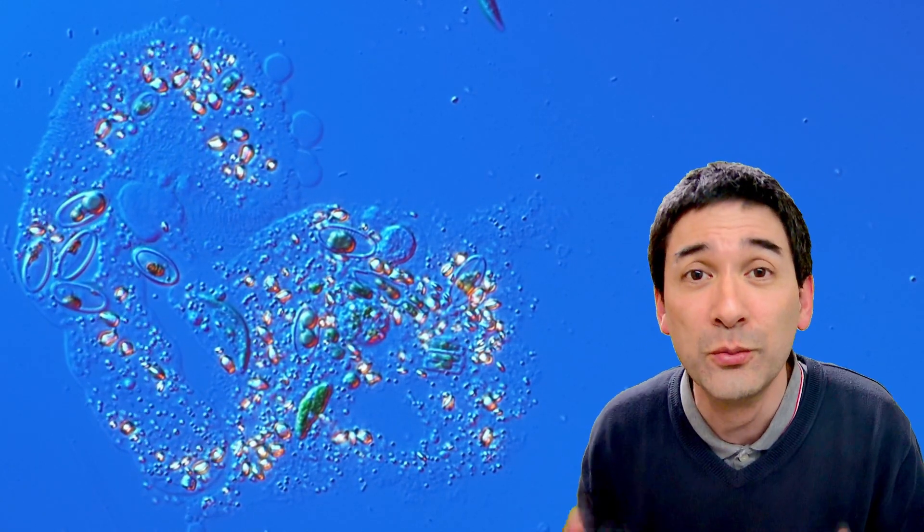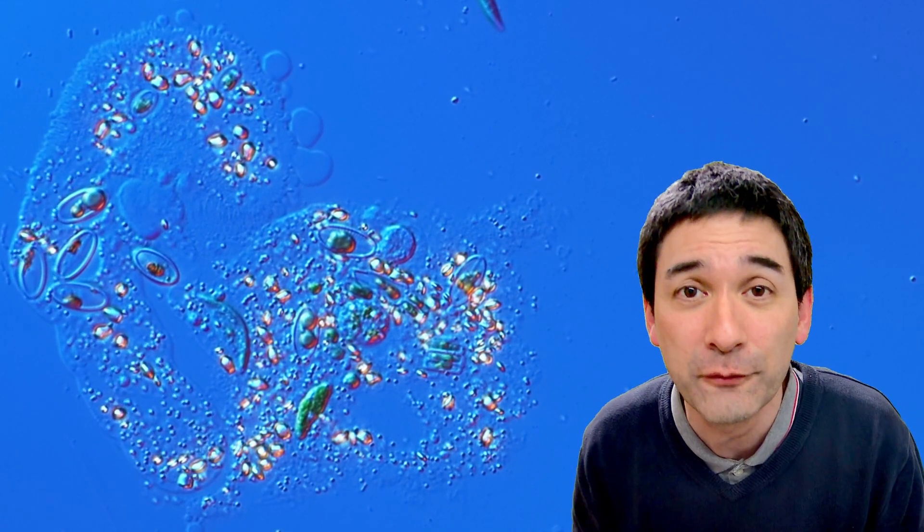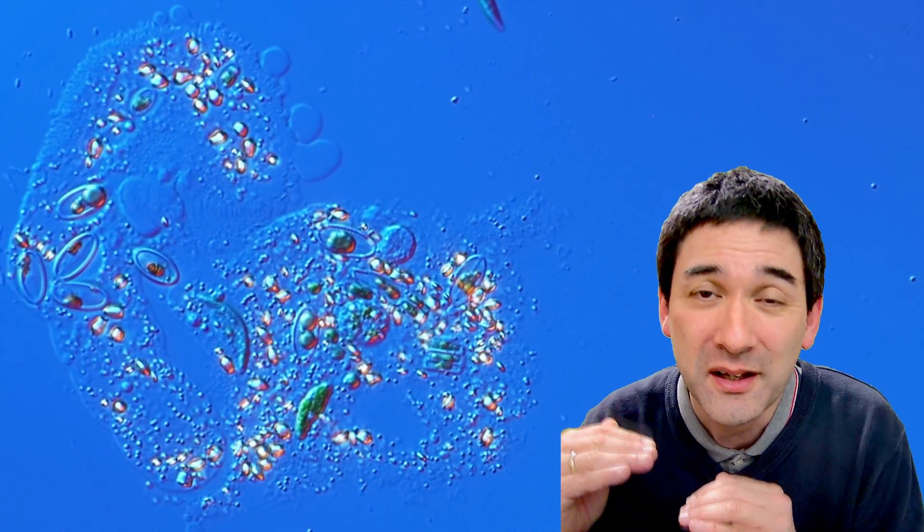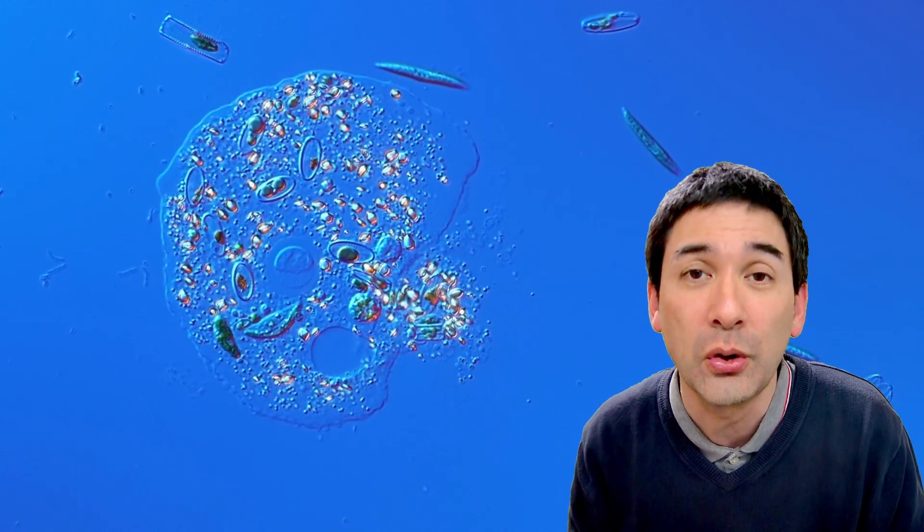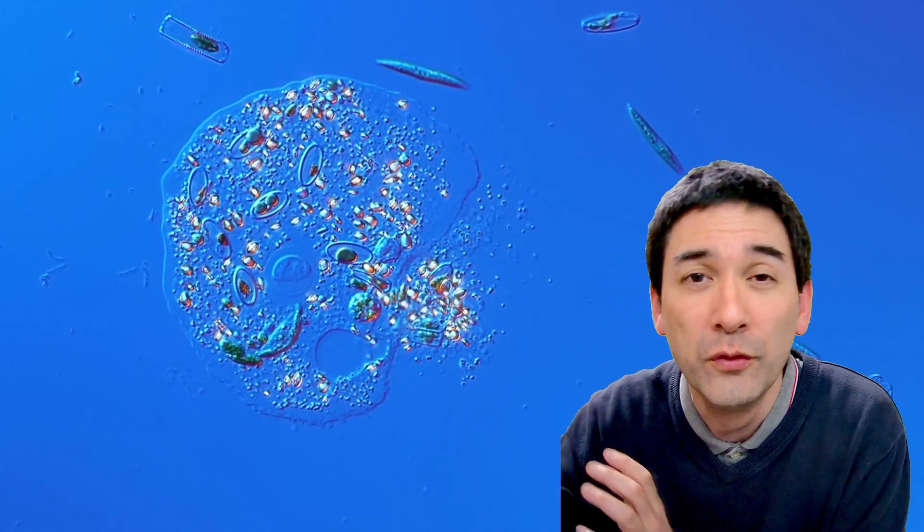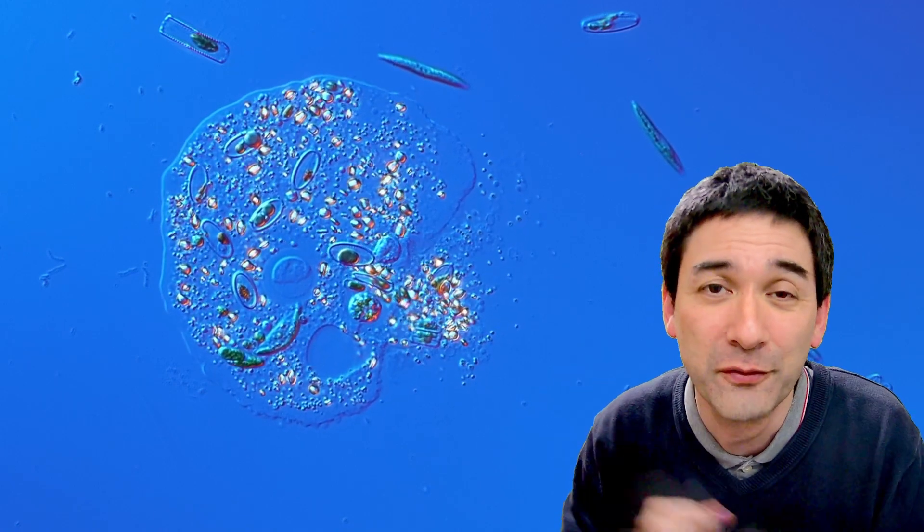By the way, this is also a very good way to actually slow down the movement of some faster moving microorganisms like paramecia, for example, simply by compressing them a little bit. And they become even better to be observed because otherwise they immediately move away and are lost outside of the field of view.